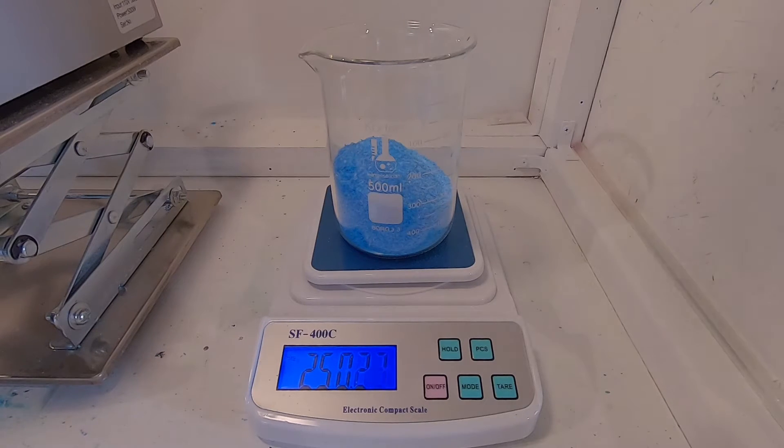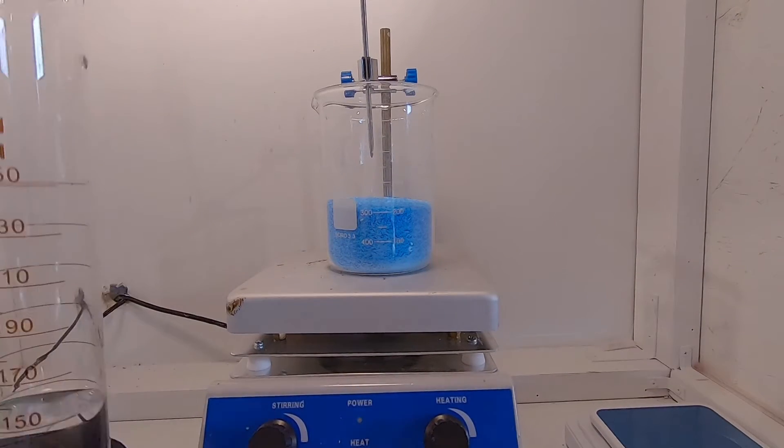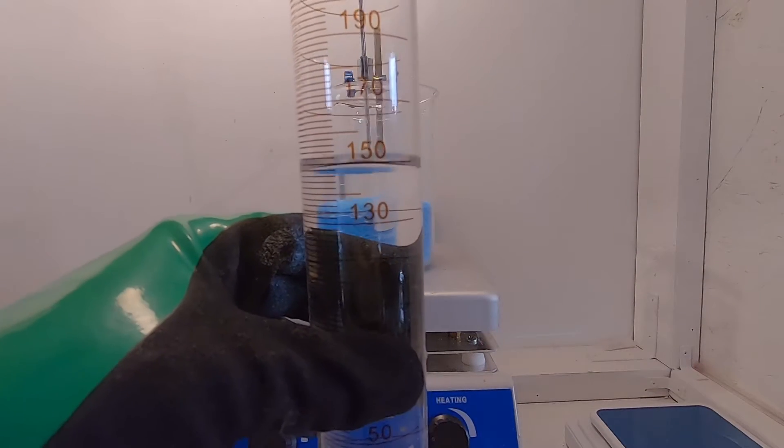First things first, I dissolved 250 grams of copper sulfate into 150 milliliters of H2O.